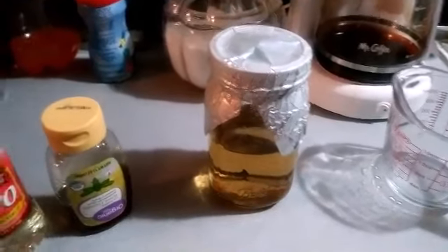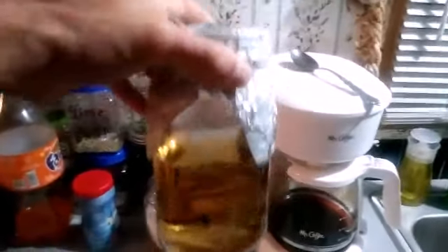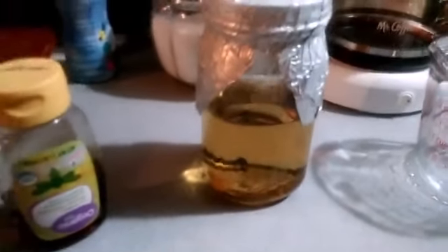Alright, it's been pressure cooked at 15 psi for 15 minutes, and it looks good. Now it's ready for inoculation, either some liquid culture or some spores. But of course, I'm a spore kind of guy.